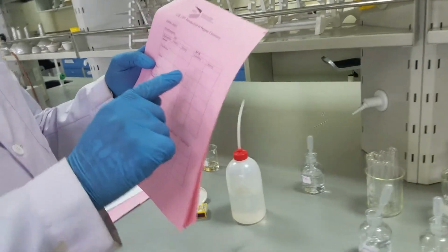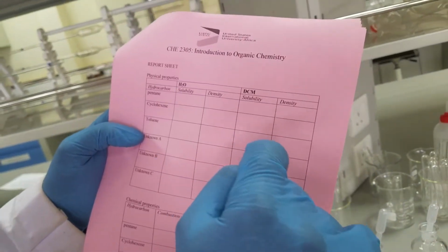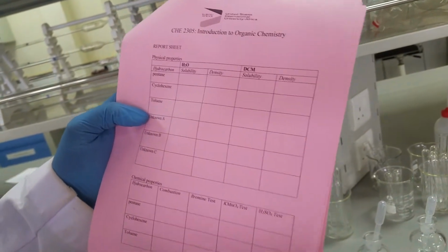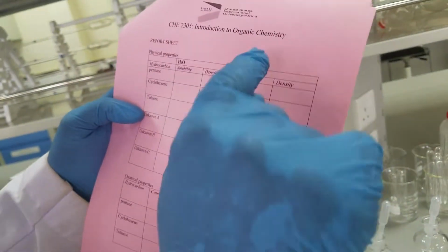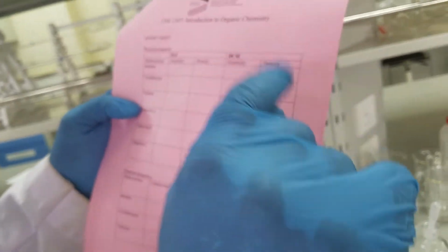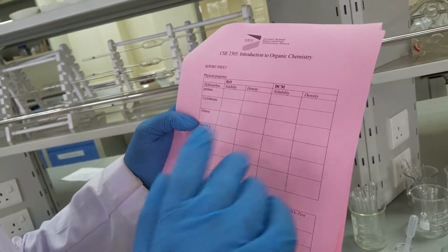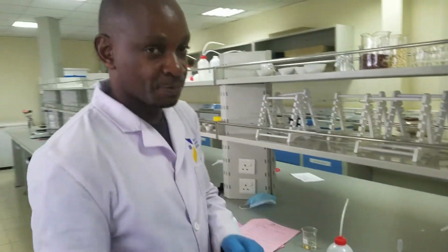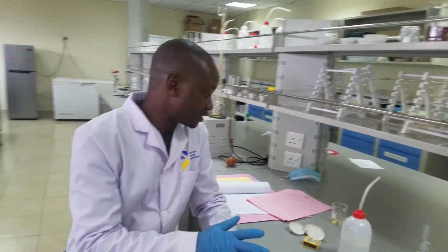So remember that if the solutions are soluble, then we don't say one is less dense than the other. So this column, you leave it out in case you see soluble. Any compounds that are soluble means there is none that is denser than the other. So our second experiment, those ones are physical tests now. And physical are things which you can see and we don't react.